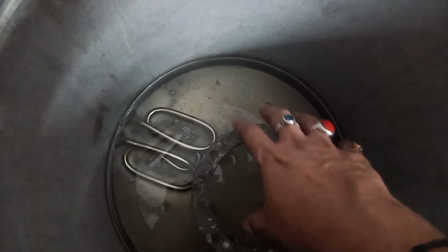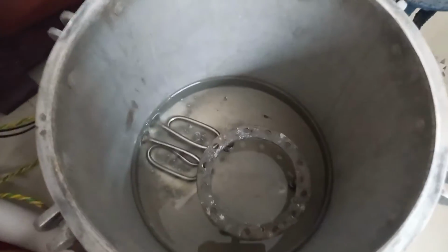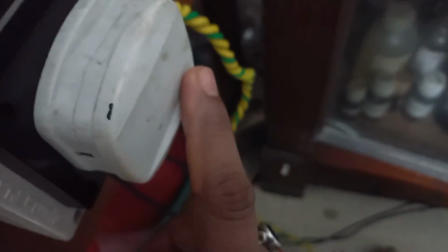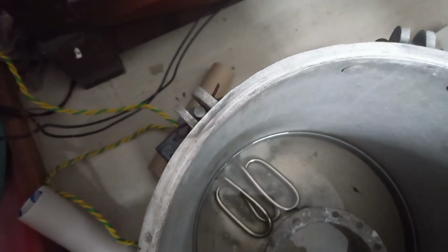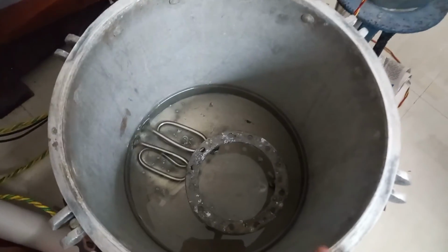And on this stool we have to keep this tripod. You have to keep the can in which you will keep the glass apparatus, or whatever you need to sterilize or disinfect. And you have to close the autoclave in the same way. Behind that is the electrical connection. As you can see, the wire goes from there up to here. So this is the electrical connection. This is the autoclave, and it is as simple as a pressure cooker.